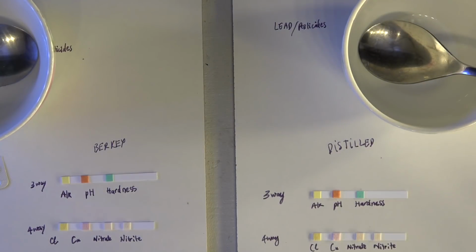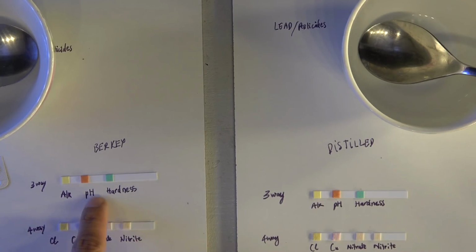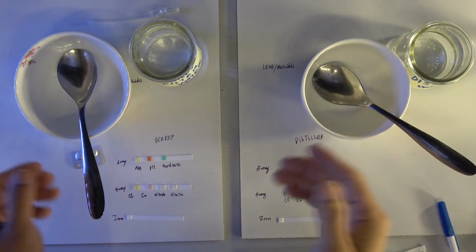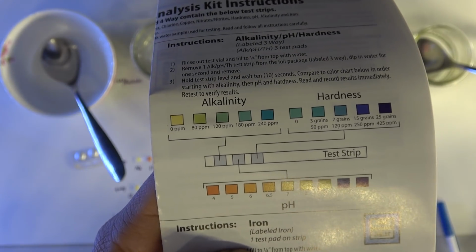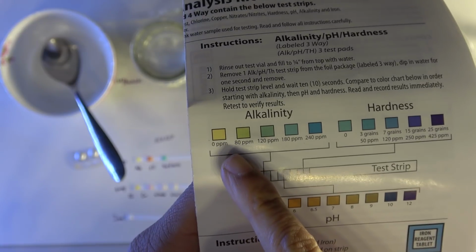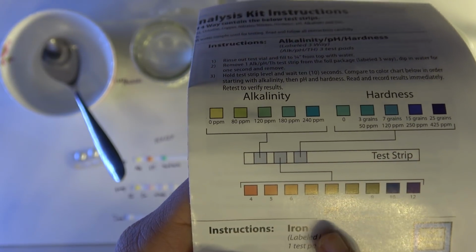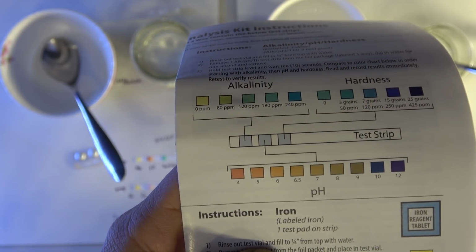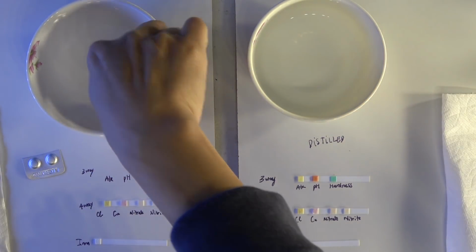Right, so my next test is the three-way test, which is alkaline, pH, and hardness. And for this, I'm just going to use my bowl here. Let's look at the chart here. For this test, you want the alkaline and hardness to be 0 parts per million. Okay. And for the pH, you want it to be at 7, as neutral as possible. Alright, here we go. You just have to dip it in water. That's it.